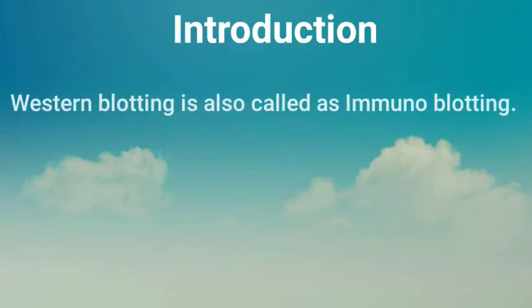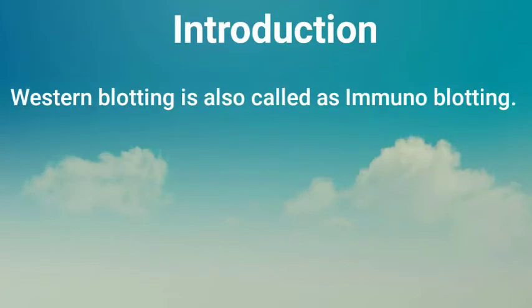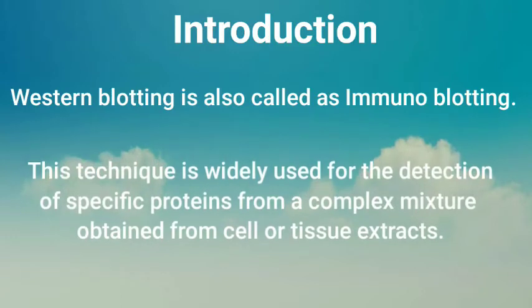Introduction. Western blotting is also called the immunoblotting technique. This technique is widely used for the detection of specific proteins from a complex mixture obtained from cells or tissue extracts.